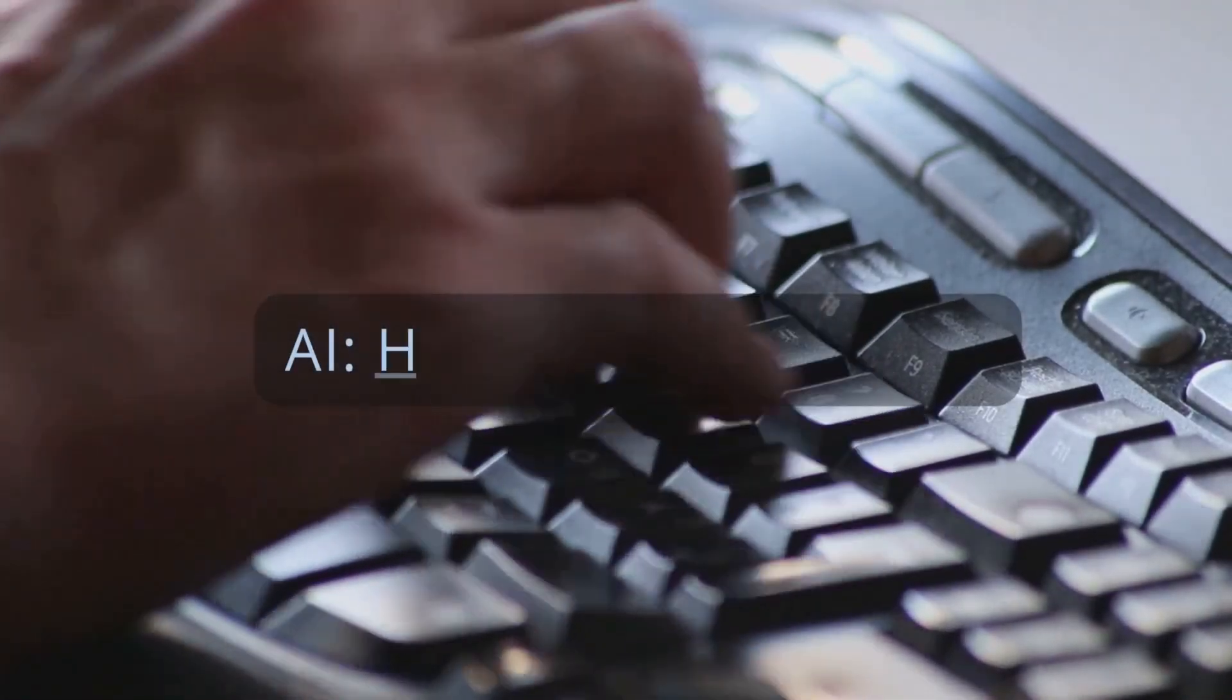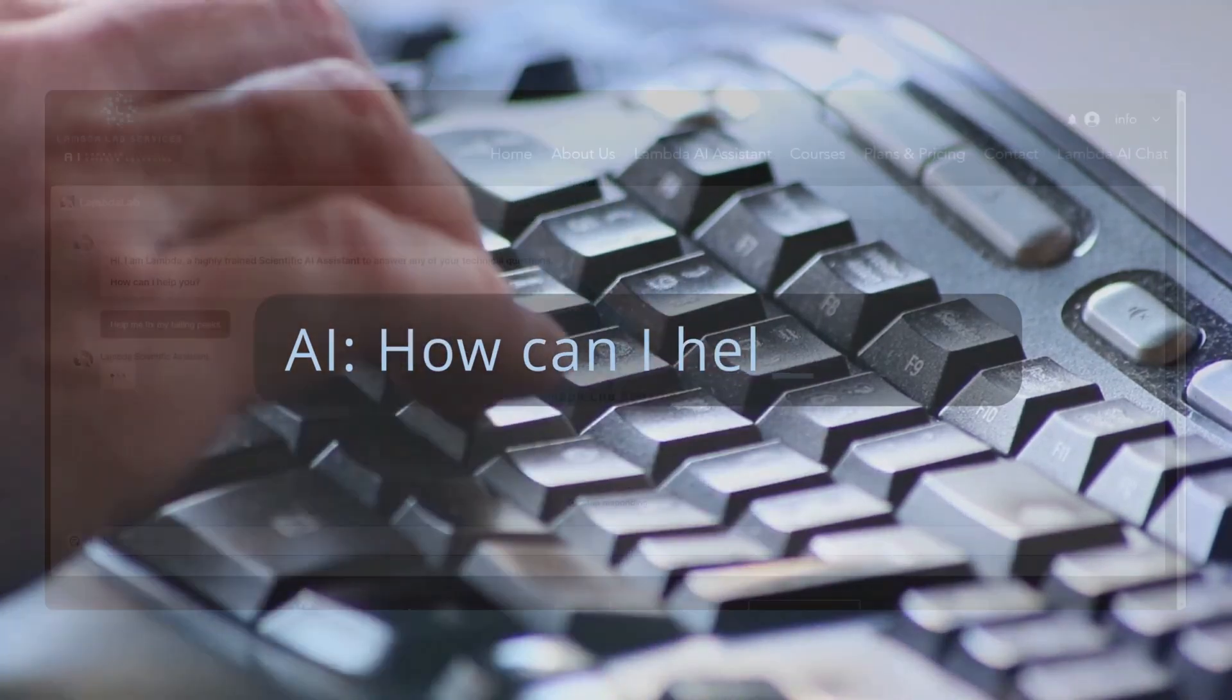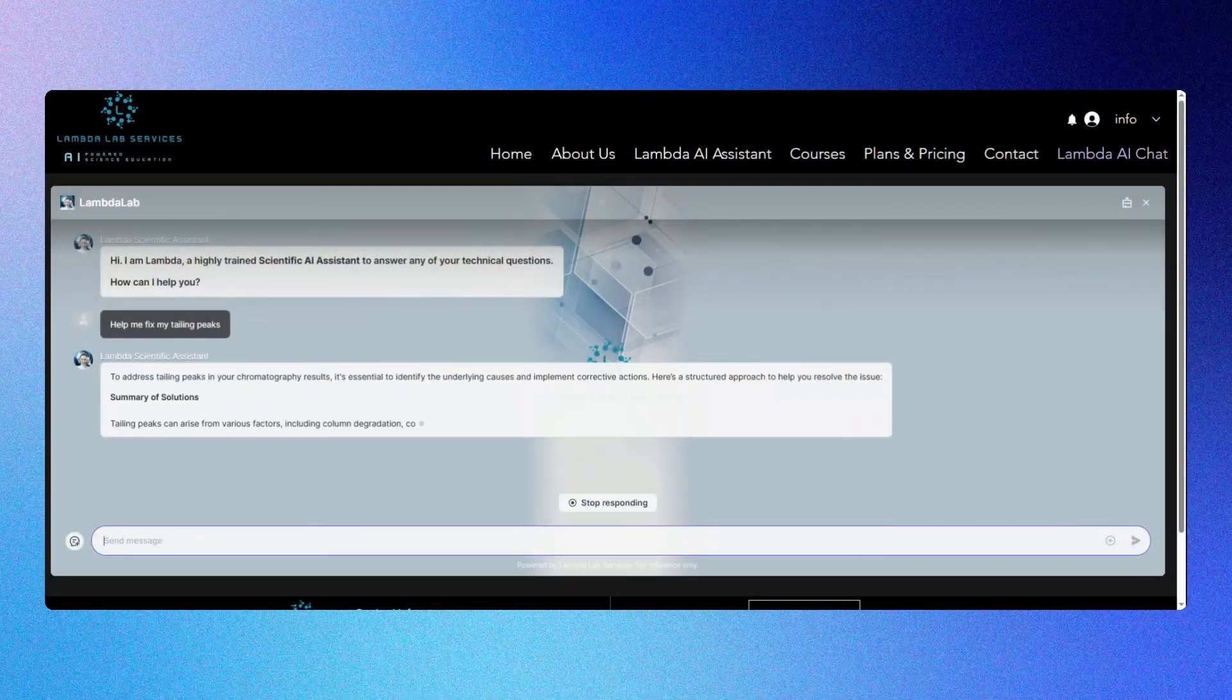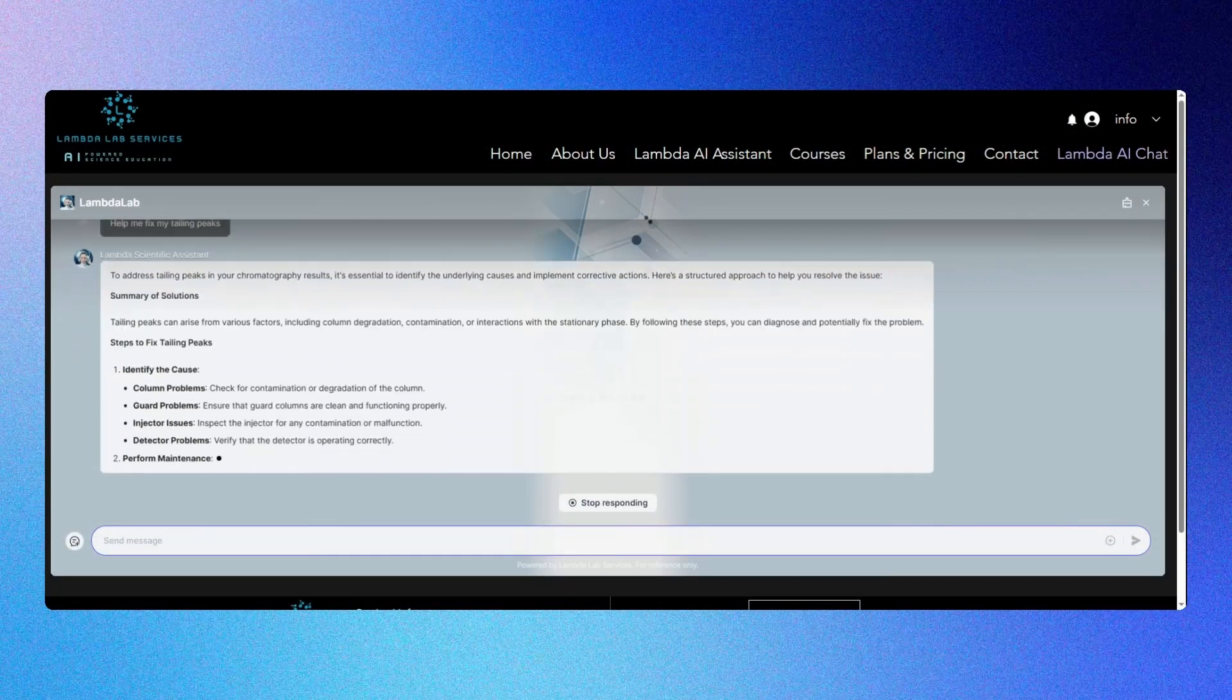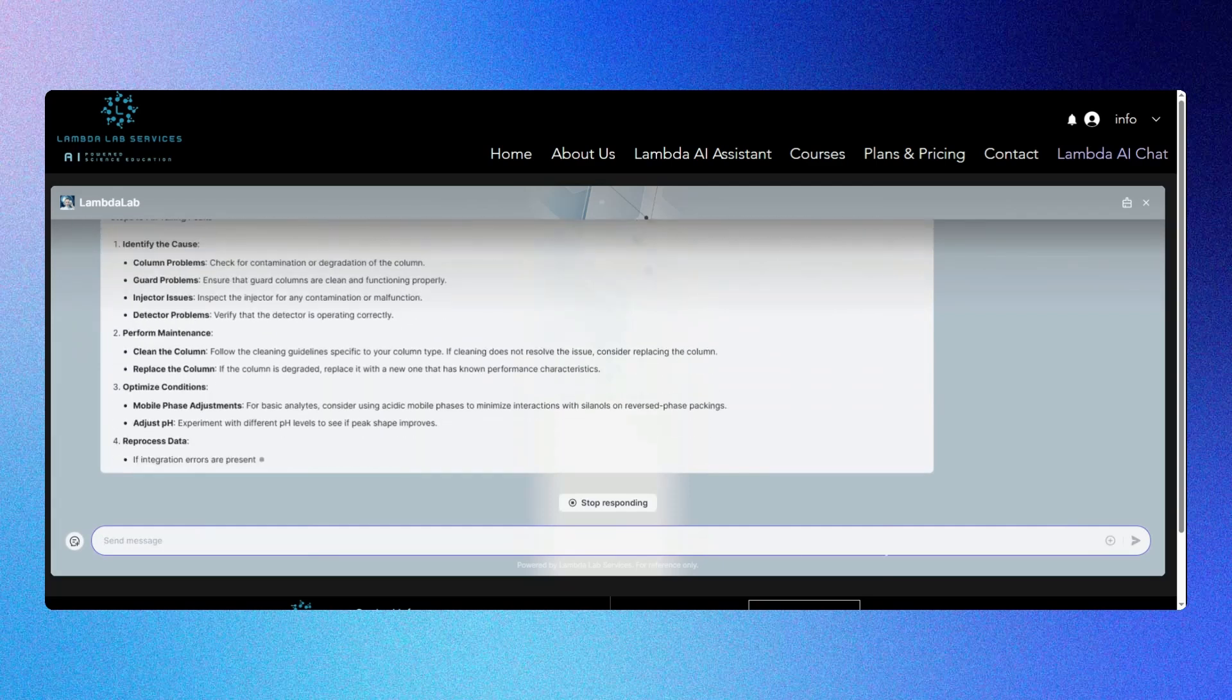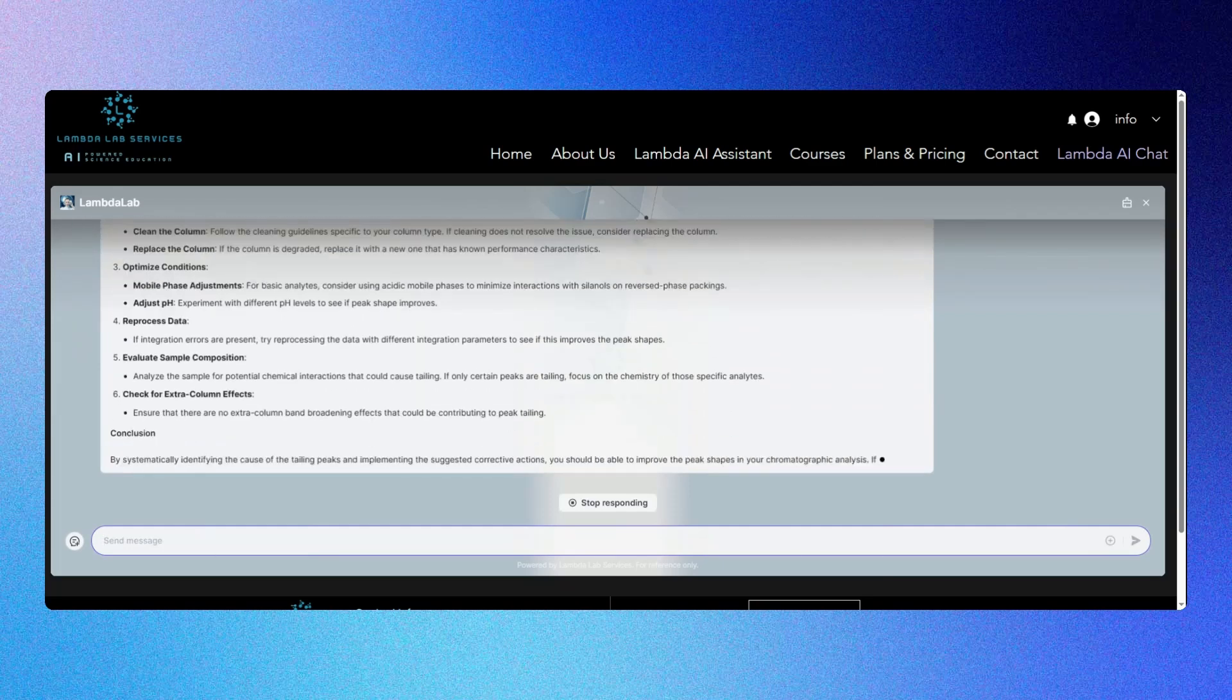Do you have troubleshooting questions? No problem. For example, just ask Lambda: 'Help me fix my tailing peaks.' Watch expert-level guidance appear in seconds, backed by a customized knowledge base created by experts.